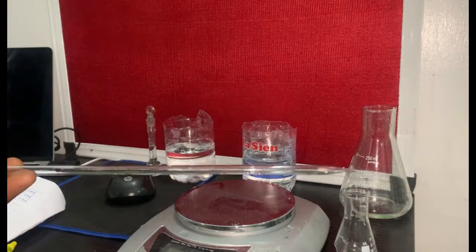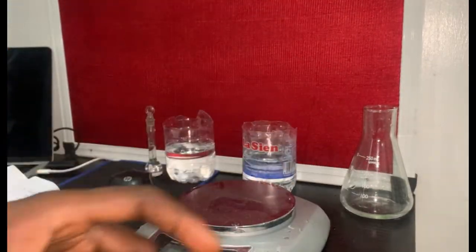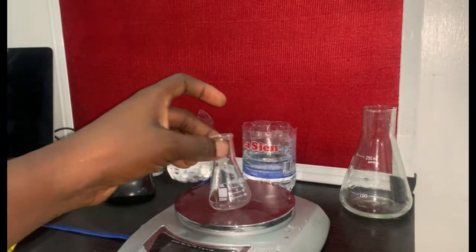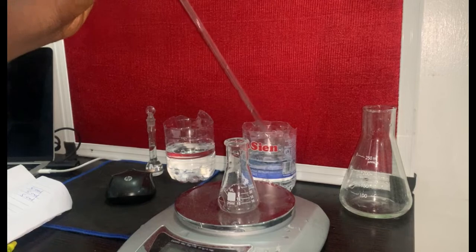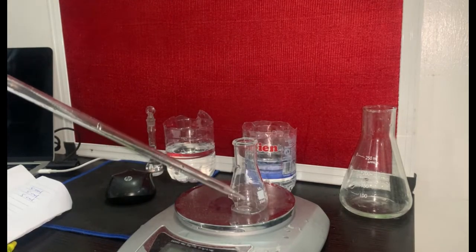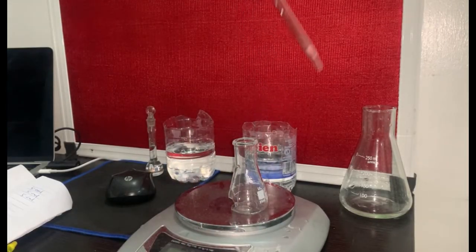When you're done with water, you're going to empty this flask. You want to do the same for the second liquid, that's ethanol. You empty this. You already know the weight of this flask, that it is 21.52. Now the next thing you're going to do is to use this pipette to take ethanol. Unfortunately, my glass got broken, so I cannot wait, so that I don't litter this table. So you're going to take this pipette and take 5 ml of ethanol and put it here.